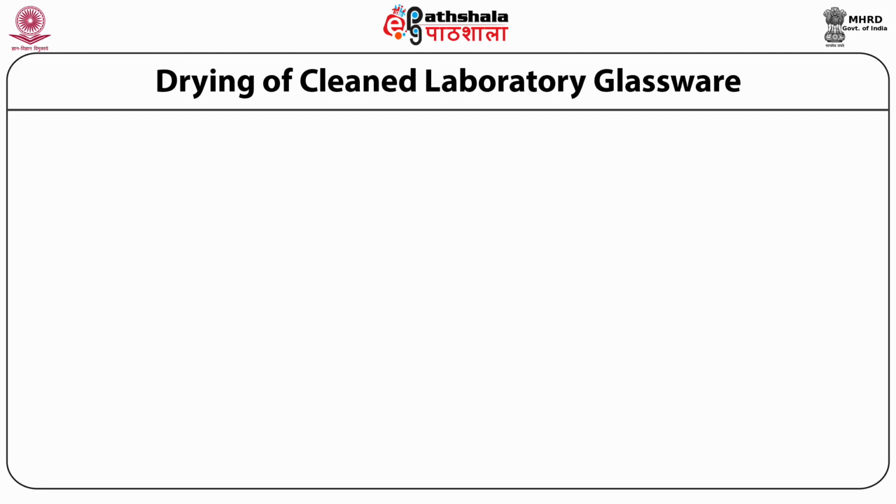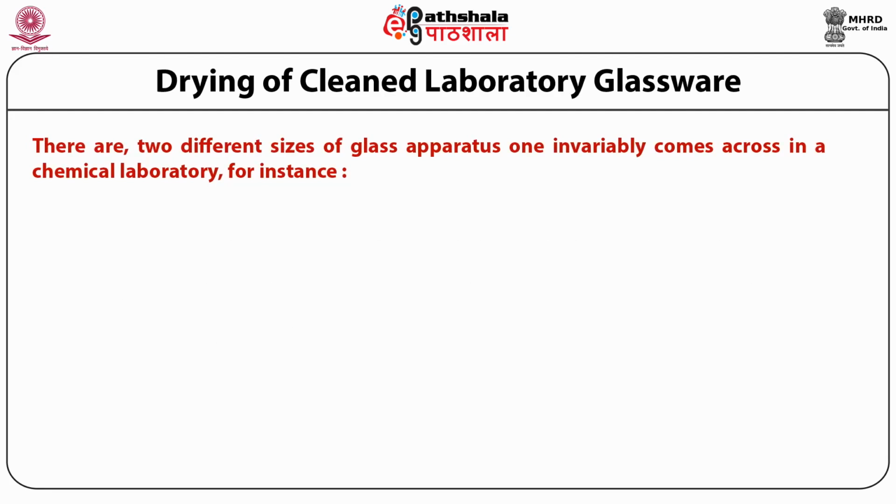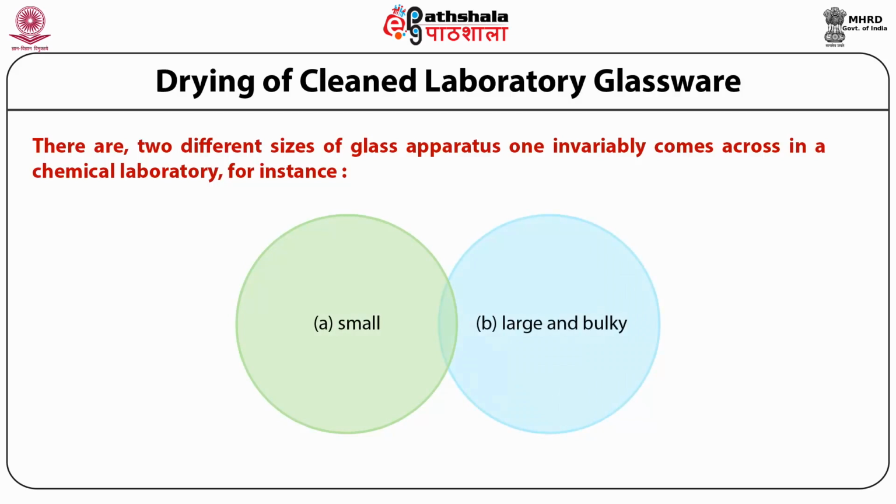Drying of cleaned laboratory glasswares. There are two different sizes of glass apparatus one invariably comes across in a chemical laboratory, for instance, small glass apparatus and large and bulky glass apparatus.